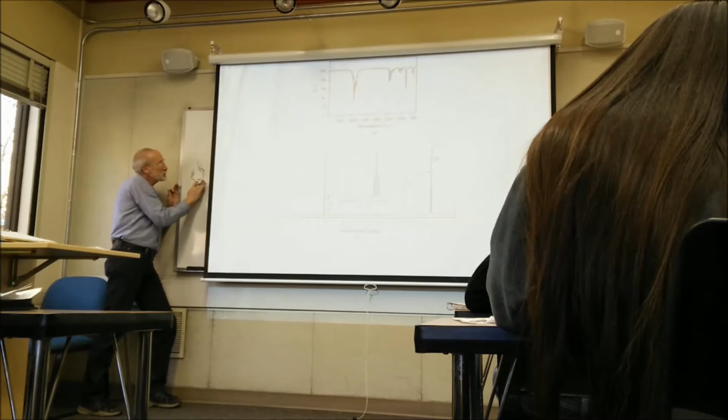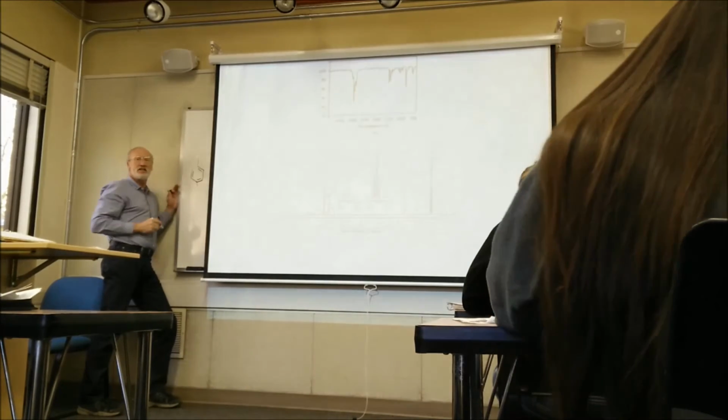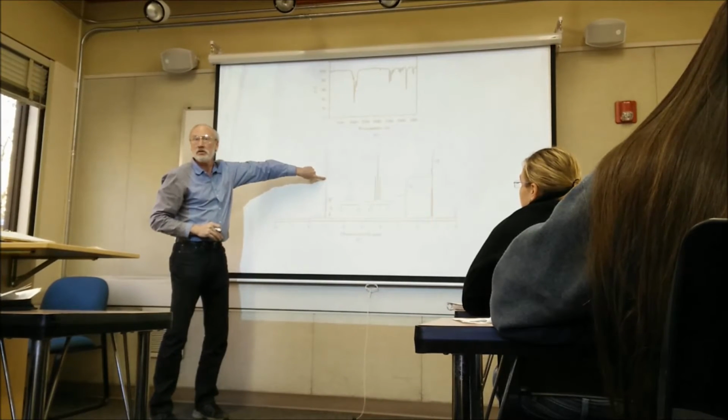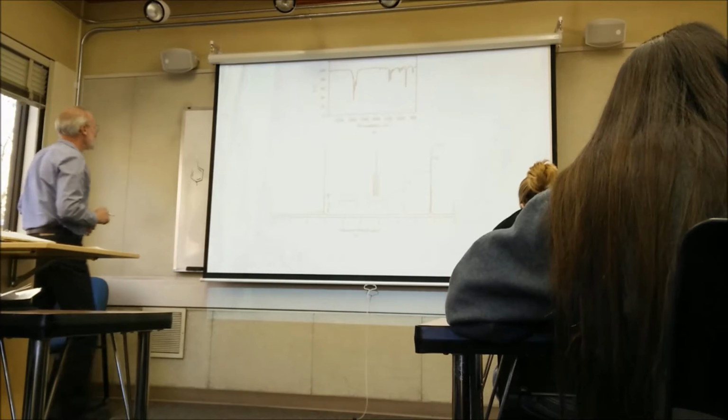But if it's para substituted, all 4 of those things have exactly the same chemical shift. Right. And you get a really sharp singlet. Okay, so now we know it's a para disubstituted benzene ring.